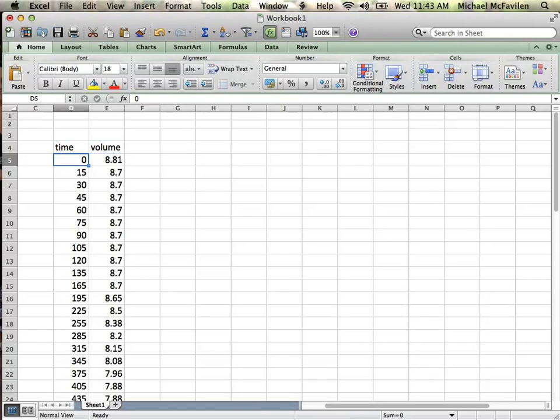So what we can do is go into Excel, and if you look all the way up at the top, it's going to be interesting going back and forth. If we click on that new cell where the 15 is, and look up at the top of Excel, there's an equation bar. See that equation bar? You notice that does not say just 15. It says D5 plus 15. What is D5? The cell right above, which is where we put the 0.